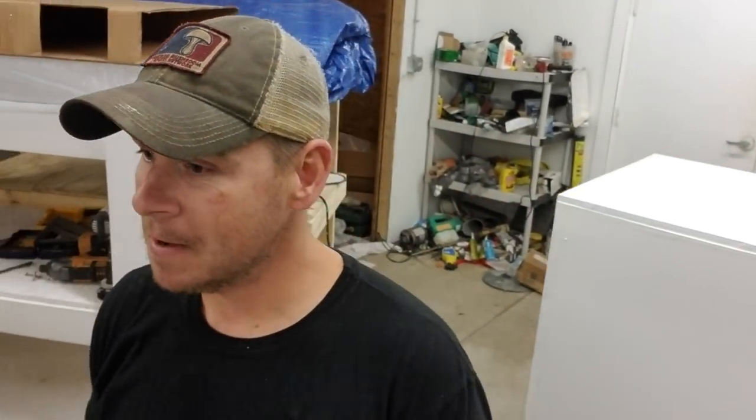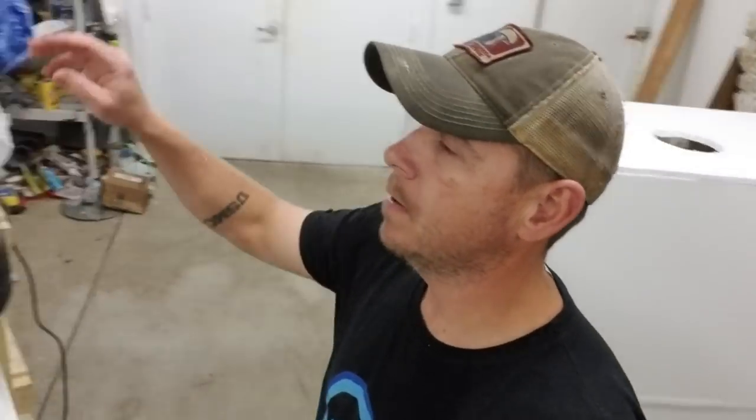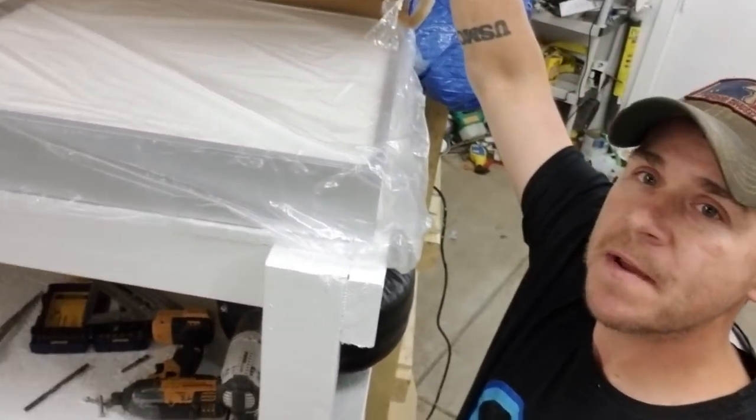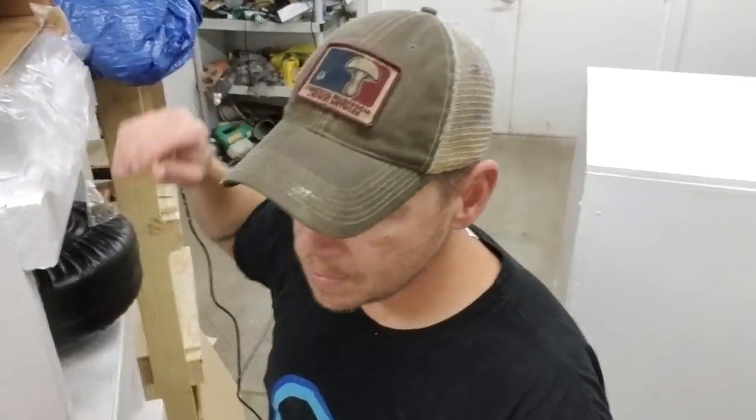I'm moving forward with building out the filters, so I wanted to go over how I build them. I am not a carpenter by trade. I use the standard 2x4 filters - basically 2x4. Eric Myers has a video where he uses the same filters.